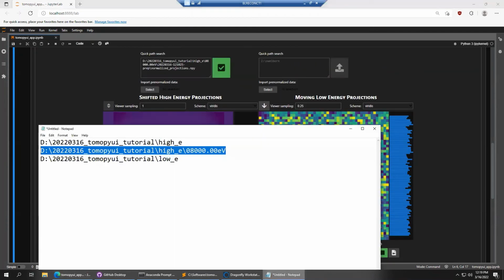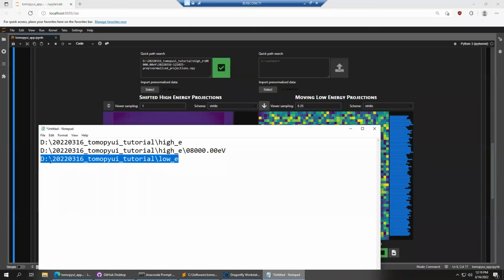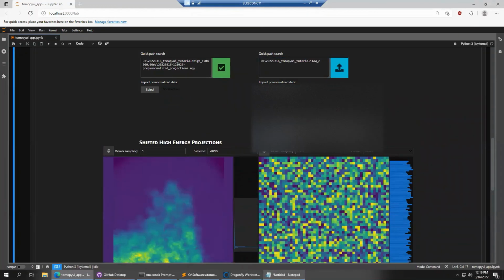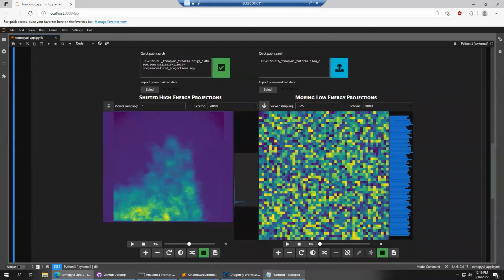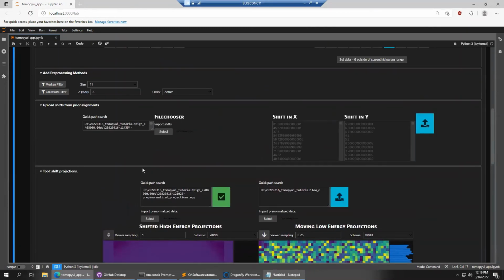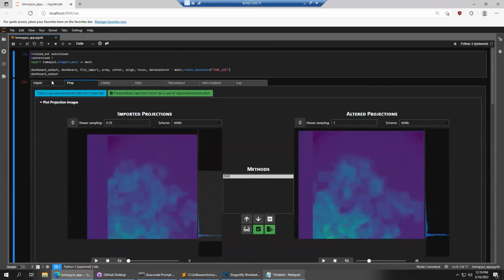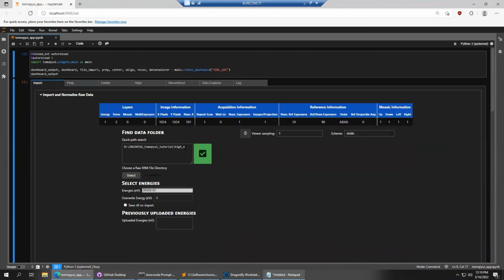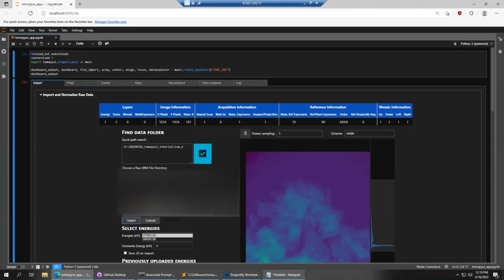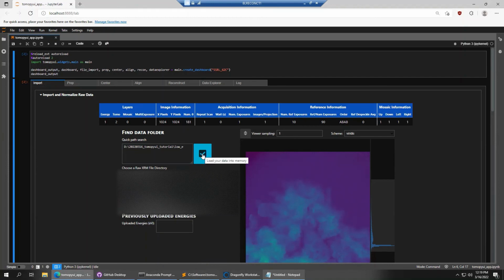And then I want to come to a low energy. Sorry, I'm going to have to import and normalize it. It'll only take a few seconds. Maybe if you guys have any questions while this loads in, feel free to ask.